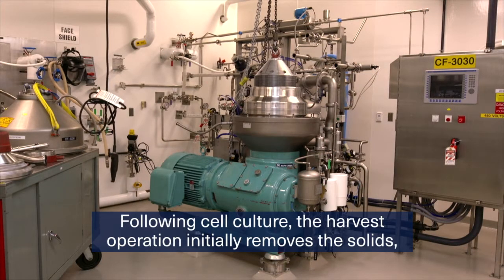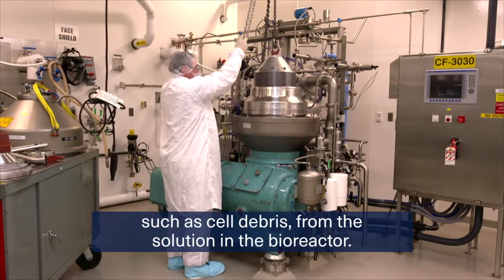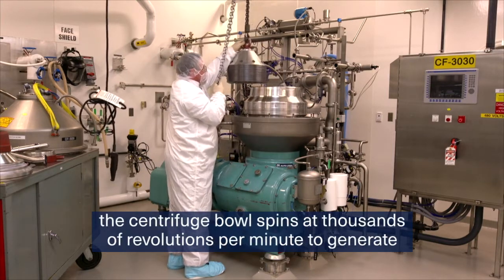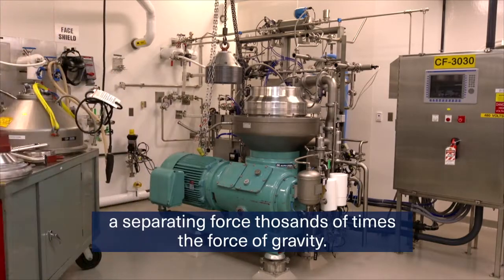Following cell culture, the harvest operation initially removes the solids, such as cell debris, from the solution in the bioreactor. One method to do this is disk stack centrifugation, in which the centrifuge bowl spins at thousands of revolutions per minute to generate a separating force thousands of times the force of gravity.